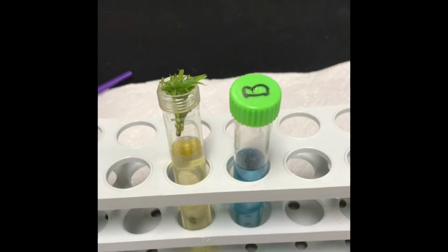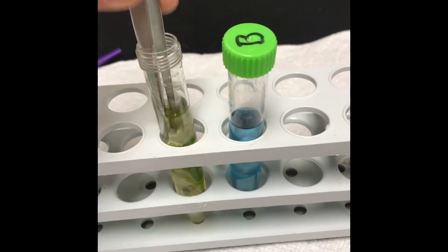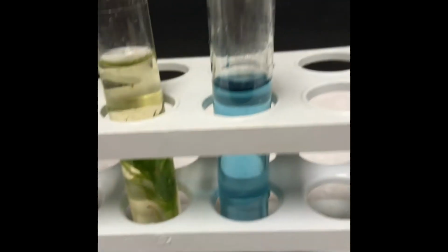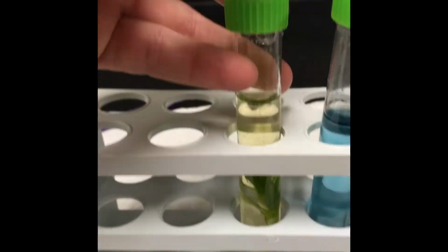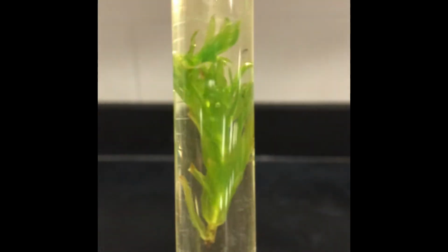I'm going to need to push it down a little bit, so I'll use my forceps. Submerge him. Okay, there you go. And he is ready to put the lid on. And our tube A is done, so you can see what it looks like. Isn't that beautiful? All right.